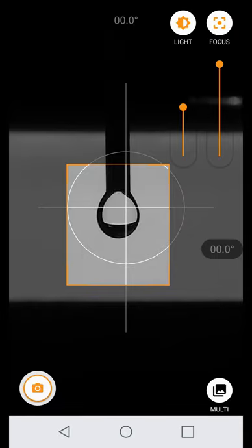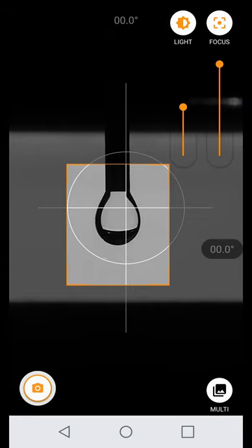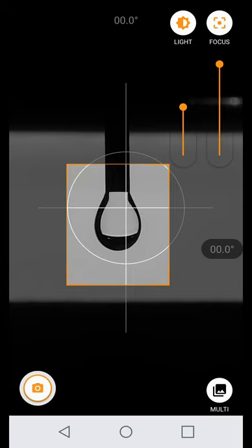Generate a droplet large enough so that it is sufficiently deformed by gravity. A nice teardrop shape is recommended. Generally, you need to aim for a droplet that's just about to detach from the needle.